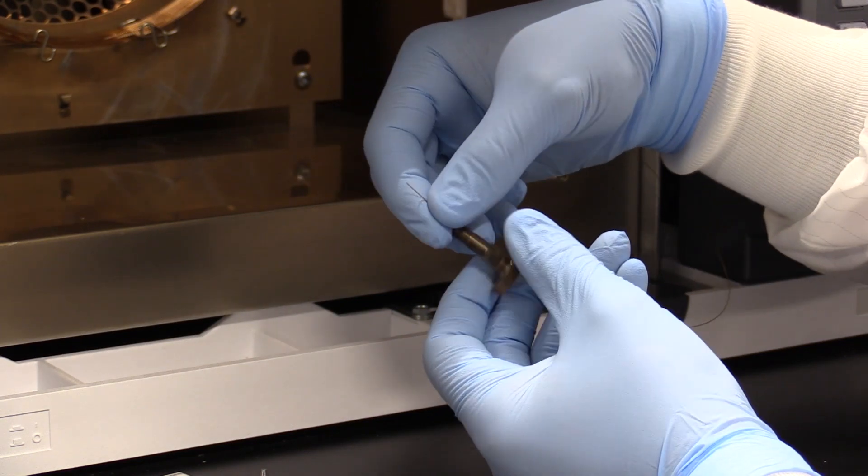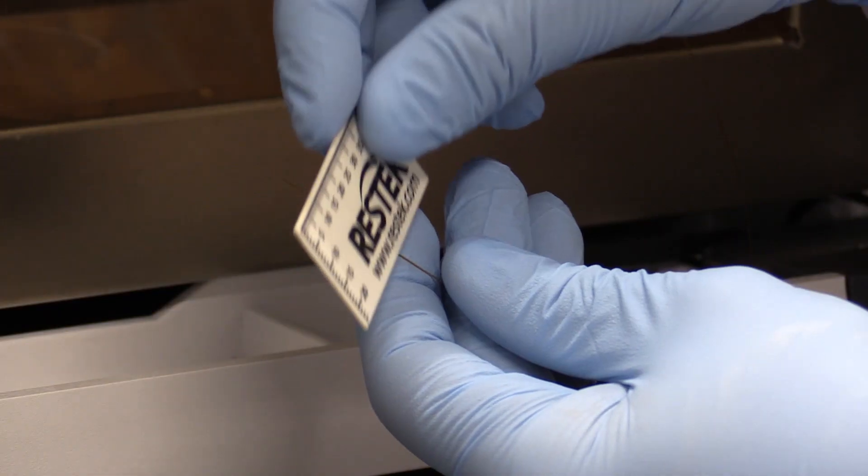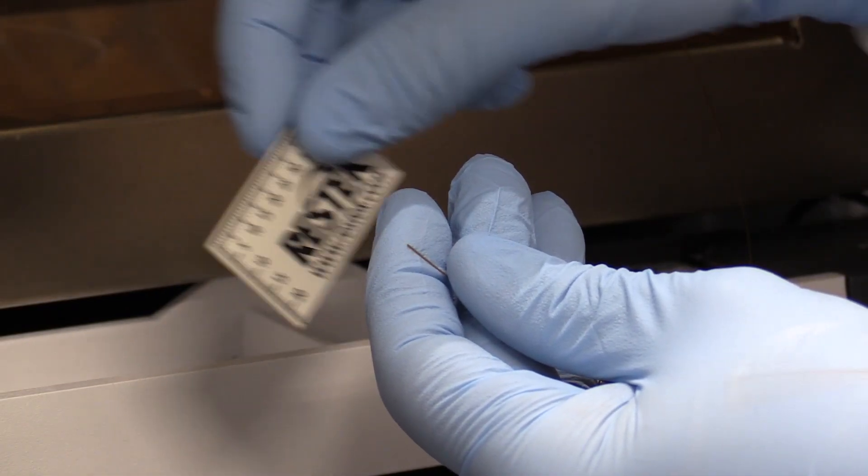Take the inlet end and slide the column nut and correct ferrule over the column end. Next we will want to cut the column end to ensure that we are installing a clean section of the column into the inlet.